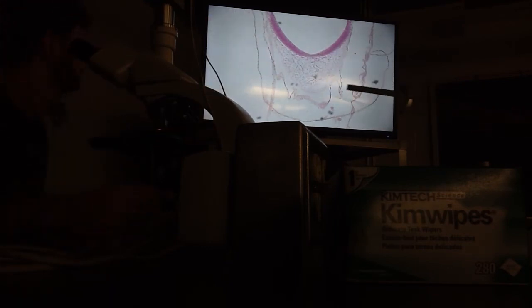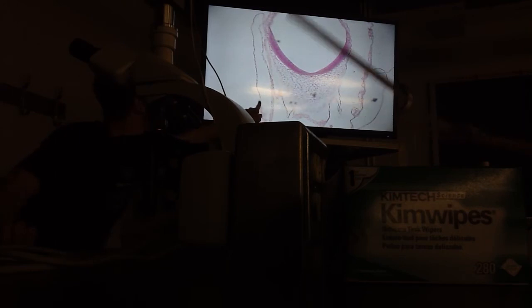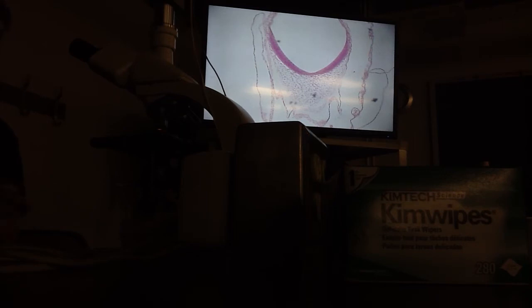Now these membranes are kind of messed up, as we shall see. But there's another membrane which is broken, but it extends out here in space. So if this is an amnion, then the next layer out is chorion. Why is it I don't see at this stage of development the allantois? Where does the allantois form? Out of the posterior body, out of the hindgut.